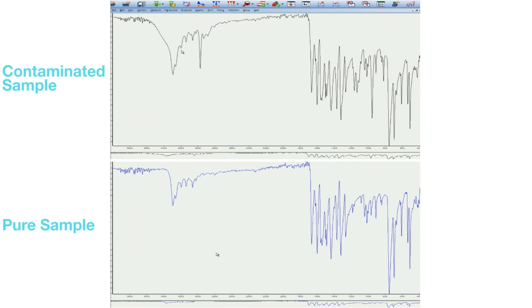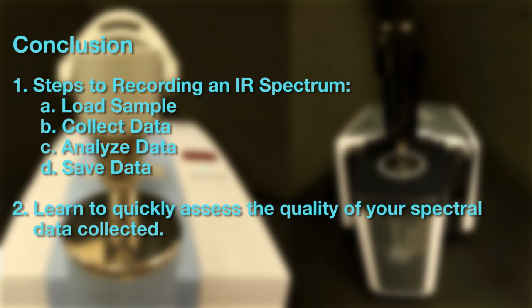Always be on the lookout for contaminants. To conclude this video, you've learned about and watched the demonstration of the four steps to recording an IR spectrum for a compound: loading of the sample, collecting the data, analyzing the data, and finally how to save the data. Be sure to be familiar with IR spectroscopic analysis—that is, what bands you are looking for and what the wavenumbers represent—because it will save you a lot of time in the end.